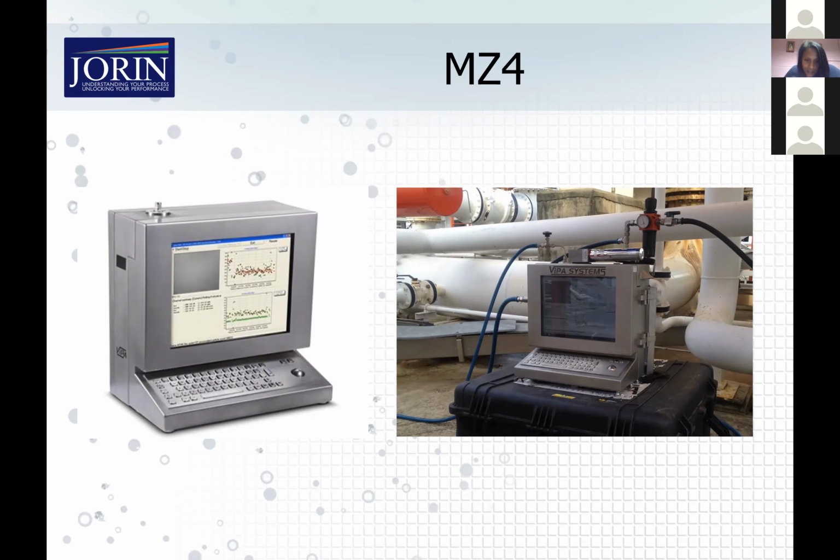And I think the last question is much the same. Are there any limitations in terms of different quality oil, higher or lower API? So again, no, for us, there is no difference in how the equipment runs, whether it's high API or low API, provided the oil forms droplets in water, then we can analyze it without any issue.